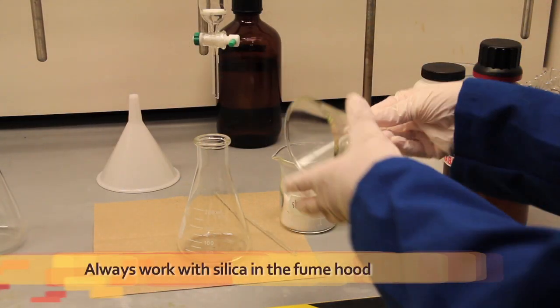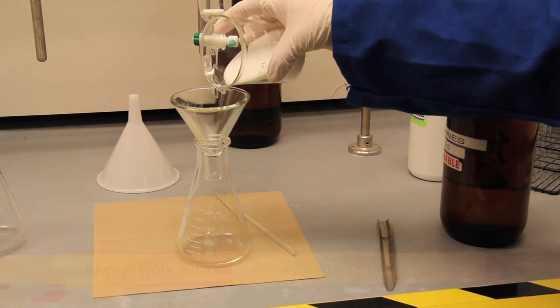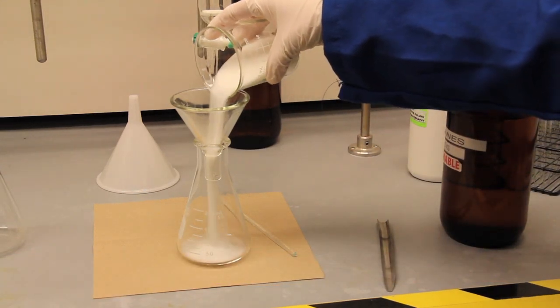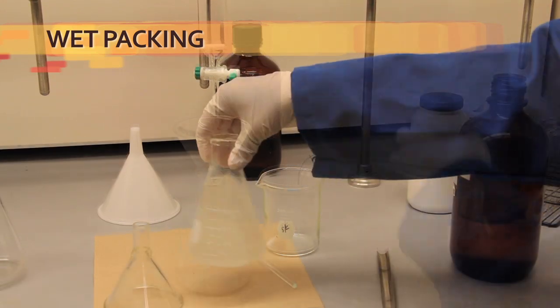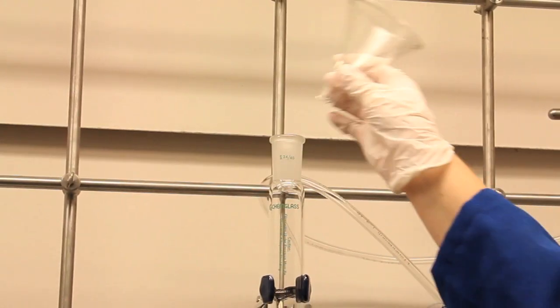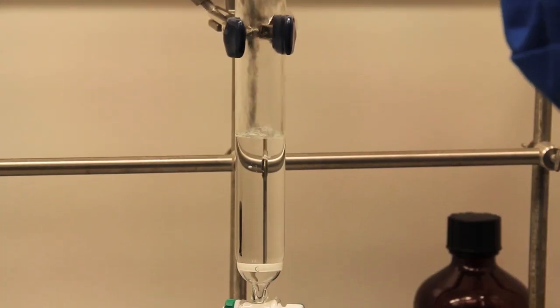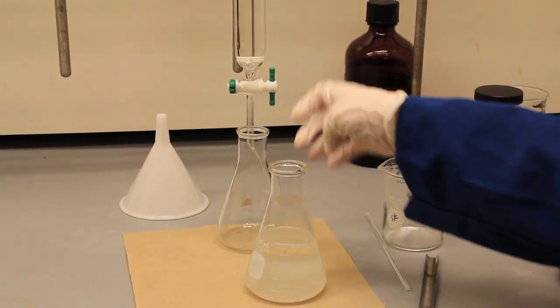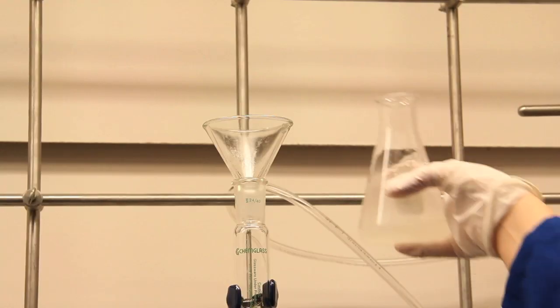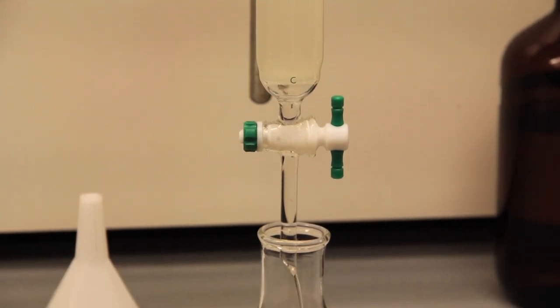I place the Erlenmeyer above a piece of paper in case some silica spills. That'll make cleanup easy. Once I have the correct volume of silica, I add enough solvent to make a slurry. The slurry shouldn't be too thick or it will trap air bubbles. Now we're ready to pack the column. The secret for good separation is even packing. I first fill the column with solvent and open the valve. Then I add the slurry through the funnel. This procedure allows the silica to set evenly.